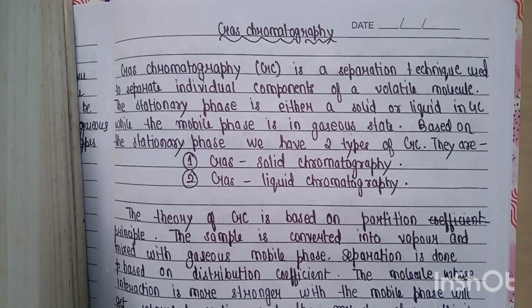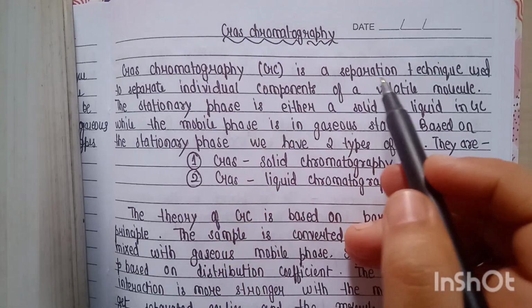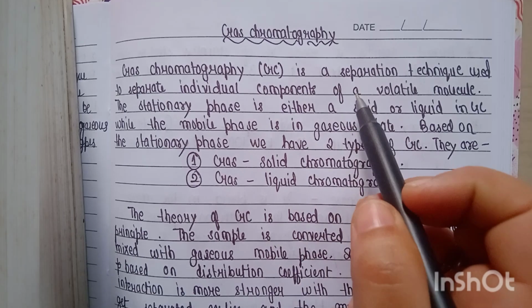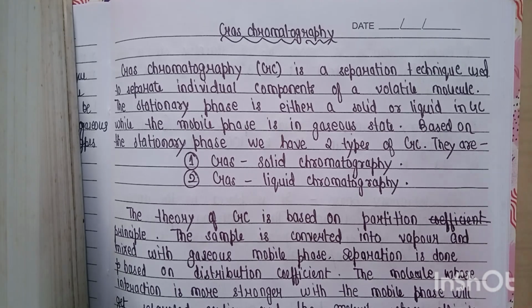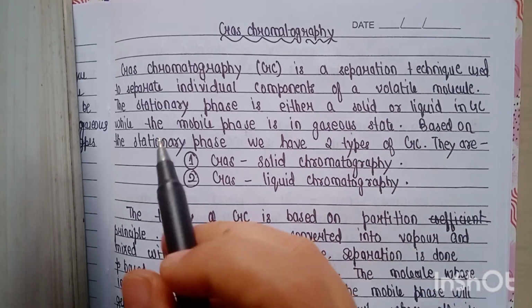Hello students, today we are going to learn about what is gas chromatography, which we know as GC, and what are the components of GC. So GC or gas chromatography is a separation technique used to separate individual components of a volatile molecule. So what are volatile molecules? Volatile molecules are those molecules which get evaporated easily at room temperature.